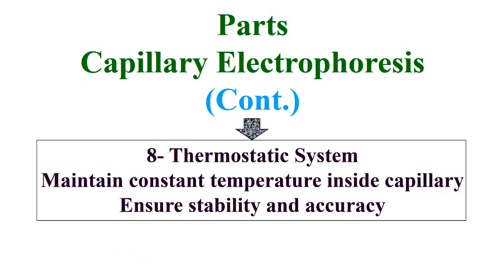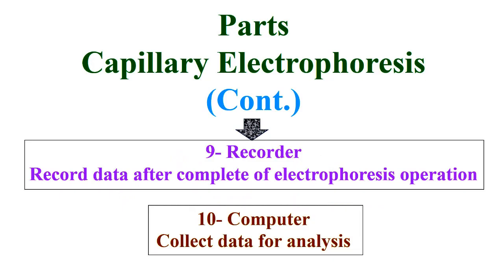And the thermostatic system, which maintains constant temperature inside the capillary to ensure stability and accuracy. And the recorder, used to record data after the complete electrophoresis operation, and the computer, which collects data for analysis, as mentioned in the next slides.